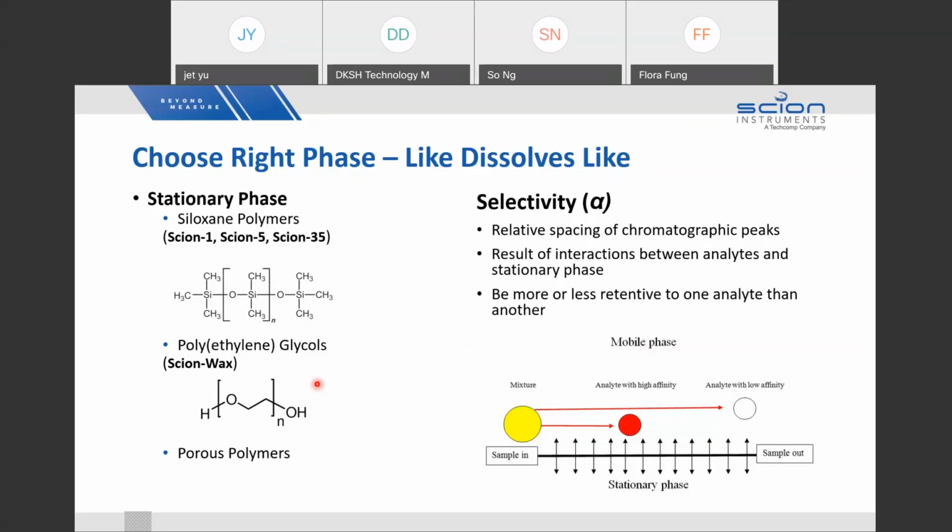So this is interaction. But when this is a stationary phase and you come with this type of non-polar groups, do you think there is interaction? No, there is no interaction, or you can say there is very weak interaction in between. So this means when your mix all has similar chemical properties, if both are non-polar and you choose a polar stationary phase, then these two are not going to be separated from each other.